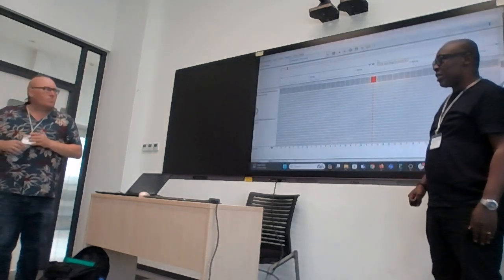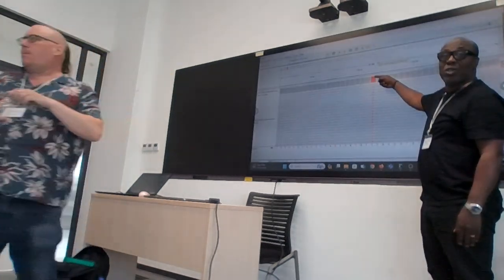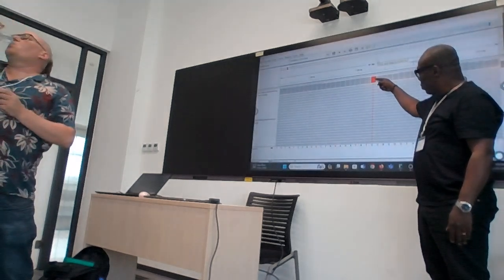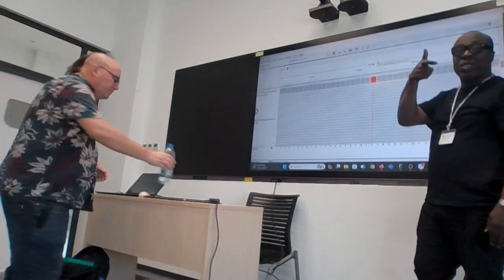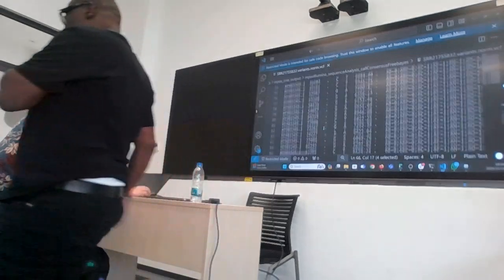And then you can see from the color of this block at the top. Okay. Ça veut dire que si c'est avec confidence, ça veut dire que c'est bien. Okay, and then I wanted to show the next one, which was this more complex one here.